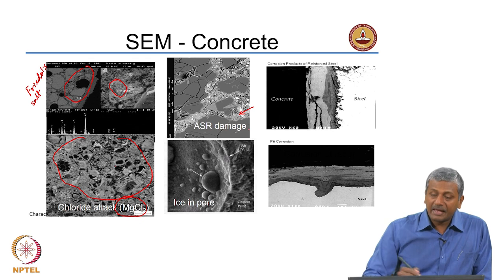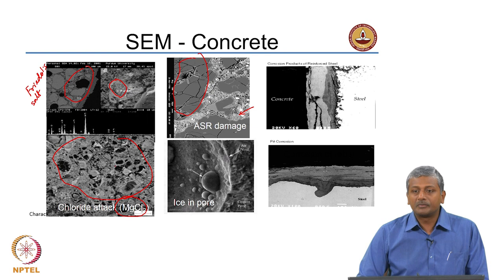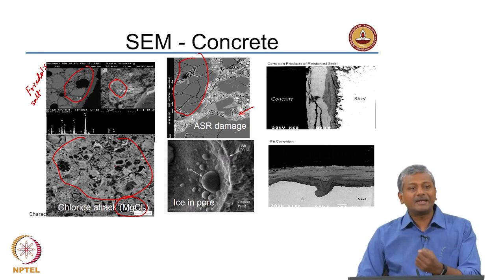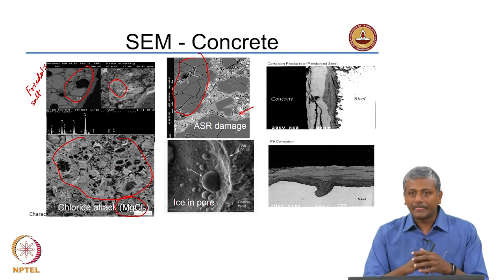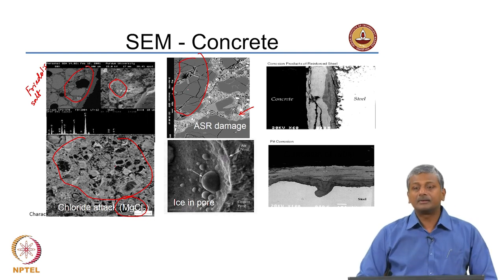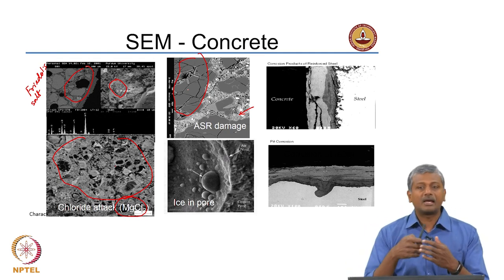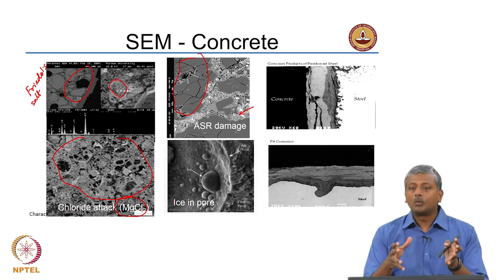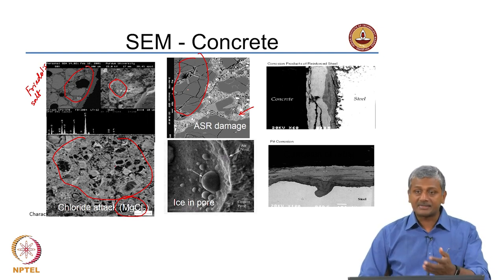This is an example of alkali silica reaction damage — the aggregate is completely cracked. Alkali silica reactivity occurs with reactive aggregate in the presence of a strong concentration of alkalis in the surrounding medium. The reaction leads to complete destruction of the aggregate, which can be imaged as cracks. We saw earlier in optical microscopy that the rim of alkali silica reaction gel forming around the aggregate was the one causing distress in the concrete.